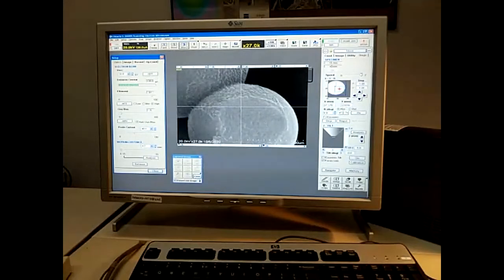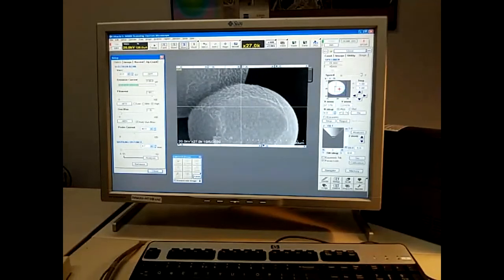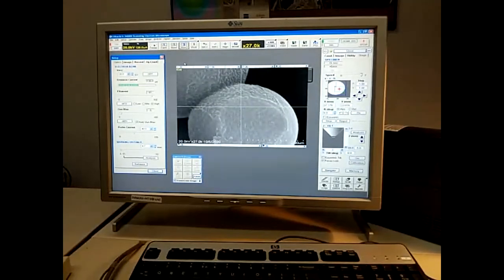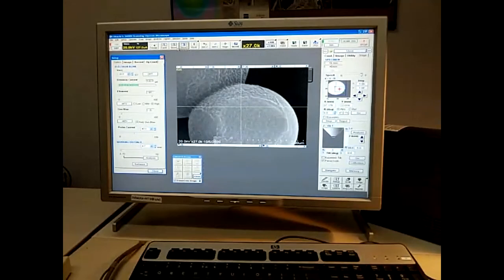It won't do full environmental, but it is capable of doing imaging up to about 30,000. The machine is rated up to 300,000. I will try to take it closer to the 100,000 range for you today, but I'm going to just pause at this point and do some adjusting.